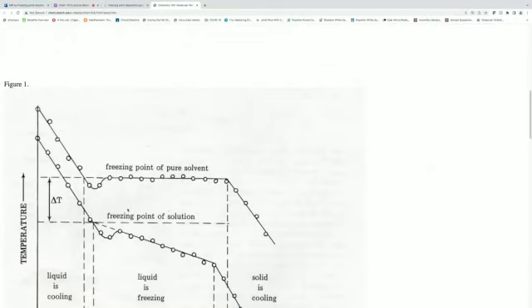This is a graph that shows you an example of a freezing point depression between the solvent only and the solution. The way this worked out, you see the beginning is all straight. It's very good. They drew the best fit line for the first few data points, and then where it stabilized, they drew another best fit line. So in the end, it looks more like the freezing point. If this is straight, then it's more like the average of these data points where it tapers off. You want to draw that and illustrate that. The freezing point will be this part right here. The second one kind of slopes down, so what you're looking for is this part right here. That's the better freezing point.